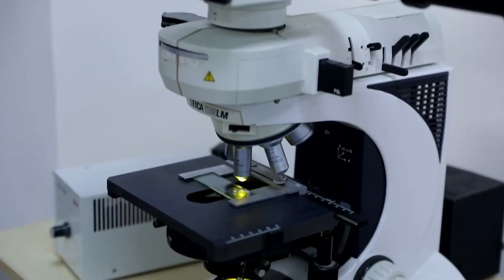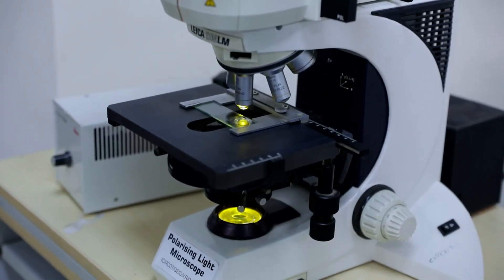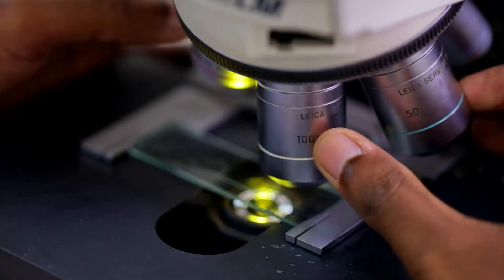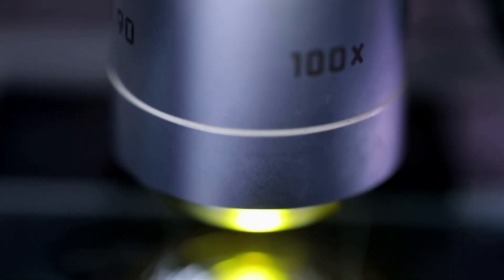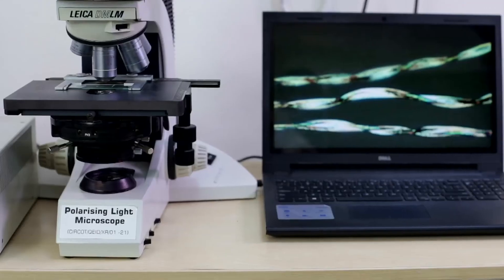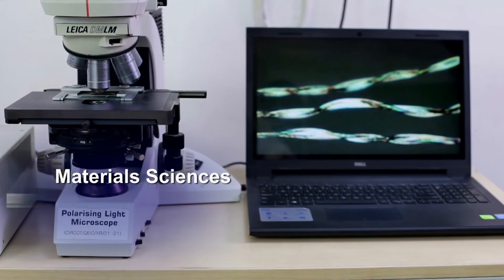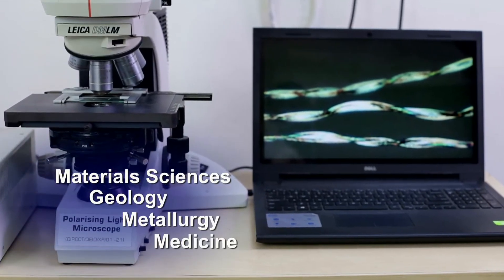Polarized light microscopes have a high degree of sensitivity and can be utilized for both quantitative and qualitative studies of a wide range of anisotropic specimens like natural and textile fibers and polymers. This is an outstanding tool across a wide range of applications.